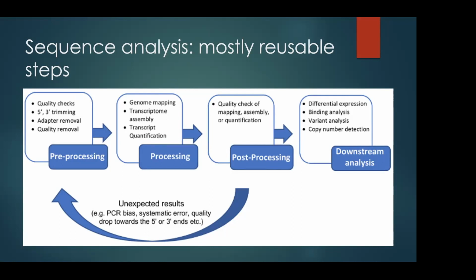When you have your RNA-seq reads, for example, if you want to quantify mRNAs, you need an annotation. But those annotations might be limited. Somebody made those analyses, they curated those annotations, and you have the latest annotation, but that annotation might not be complete.